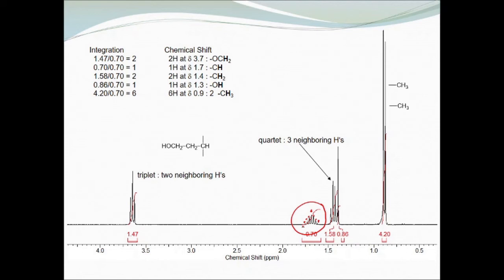We can clearly see 7 peaks, but it is possible there are 2 more, which leaves us the question, is this a septet, meaning 6 neighbors, or is this a nonet, meaning 8 neighbors? Could be either one. It could be that there are 2 more little peaks out at the edges that we can't see. It's definitely at least a septet, possibly nonet.